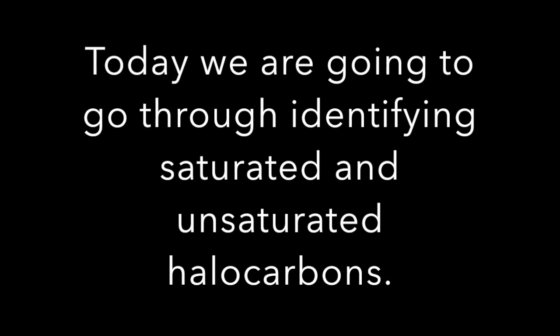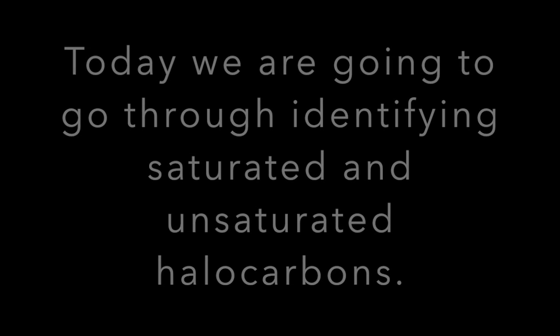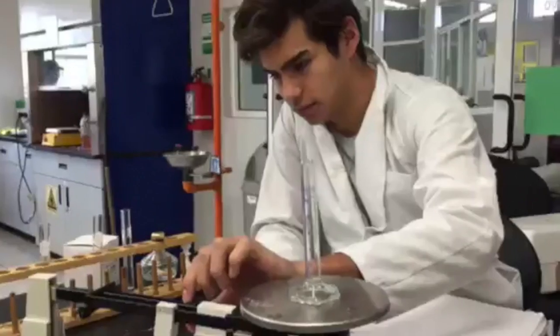Welcome! Today we are going to go through identifying saturated and unsaturated halocarbons. But first I would like to go through the materials that we used for our experiments.